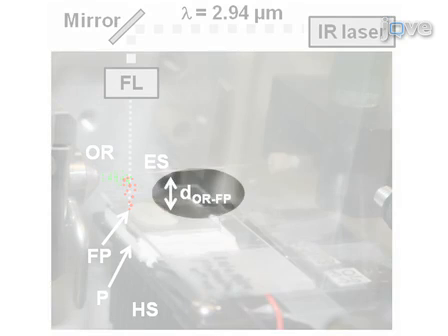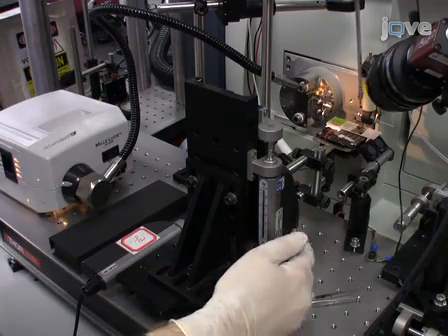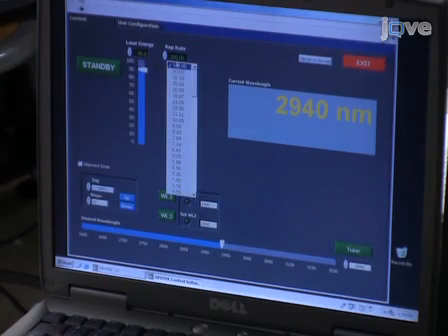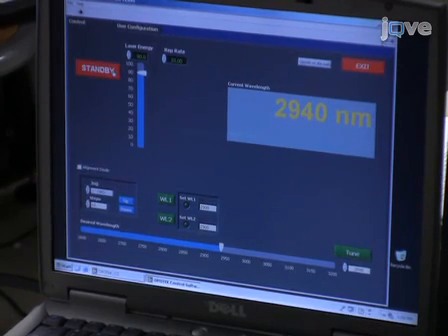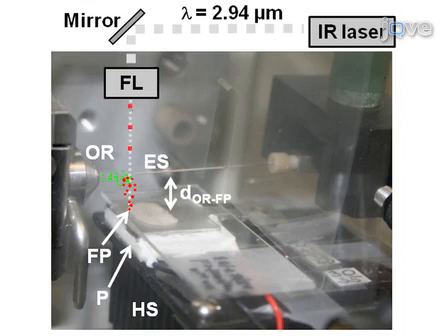Precise adjustments of the experimental parameters are required to accommodate the sample of choice. To optimize the ion source, start by positioning the sample 15 to 20 mm below the orifice of the mass spectrometer sampling cone. Operate the mid-IR laser at 2.94 micrometer wavelength and 10 Hz repetition rate. Attenuate the laser output to around 100 microjoules per pulse energy. Use a combination of gold mirrors and a focusing lens transparent at the laser wavelength to couple the laser light energy into the sample at normal incidence.